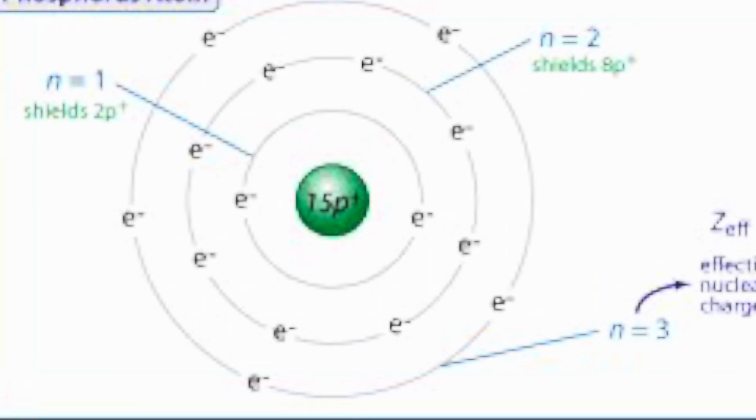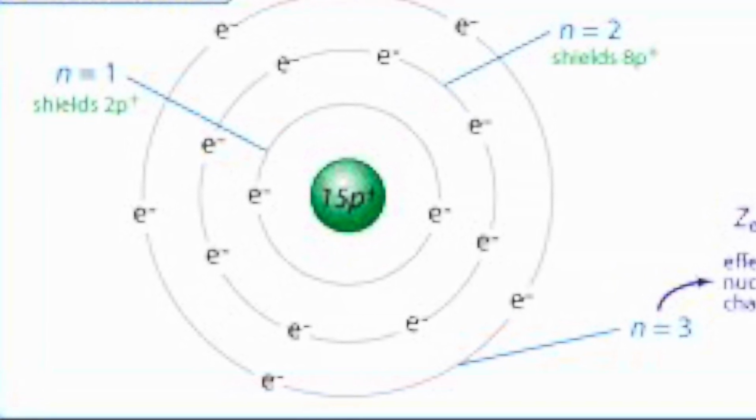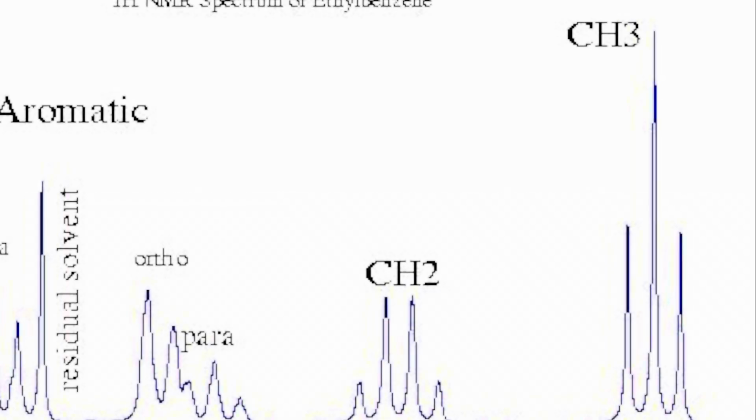Now, it's not unreasonable to think that all atoms would have the same energy value, but this isn't true because of shielding and electron shells. Now, the energy given, rather than in joules, is measured in parts per million, because the value is so low, and that's what appears on your NMR spectroscope. NMR can be used to find the formula, structure, or the purity of a sample.